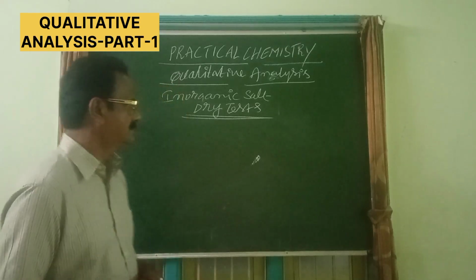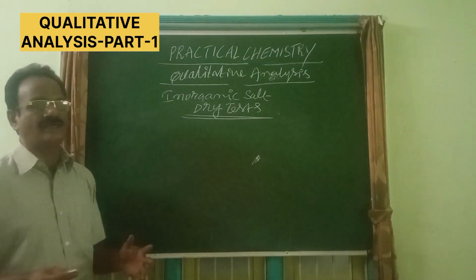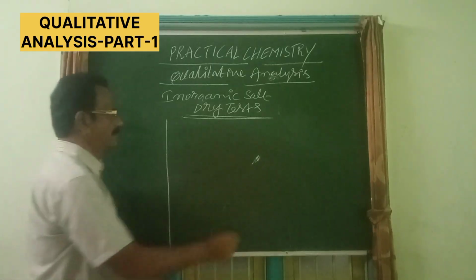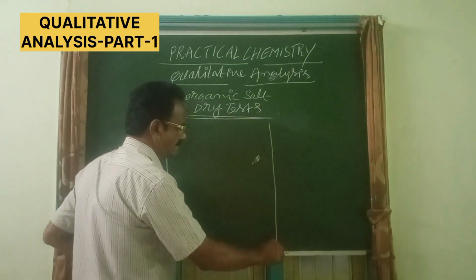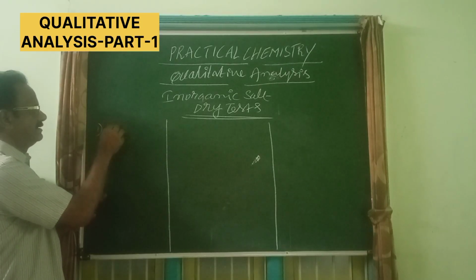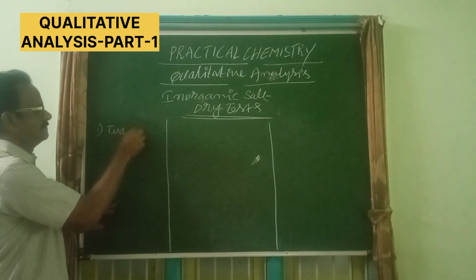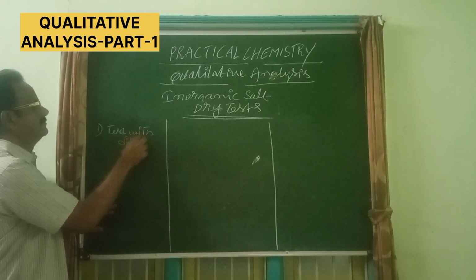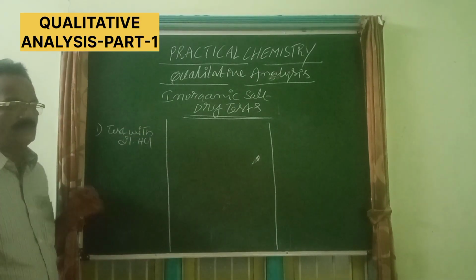Now, among dry tests, the first test is the test with dilute HCl.